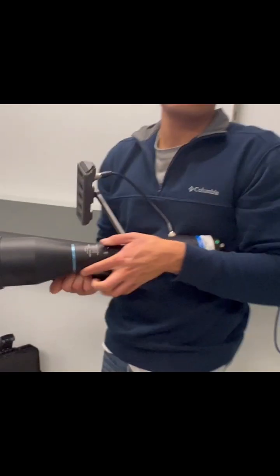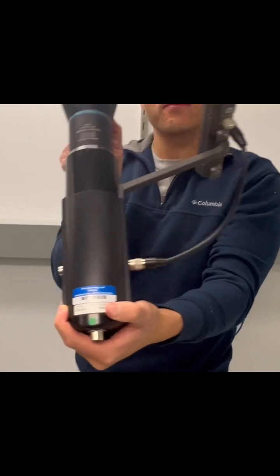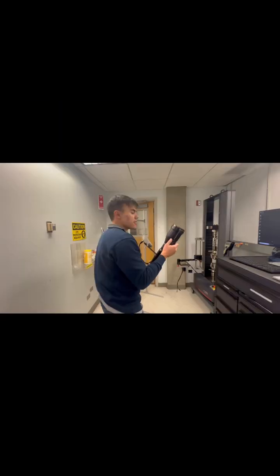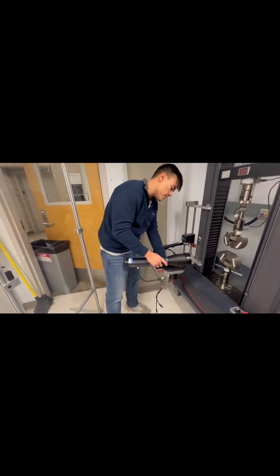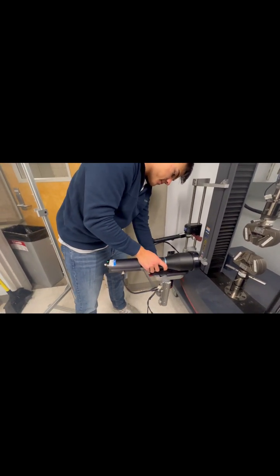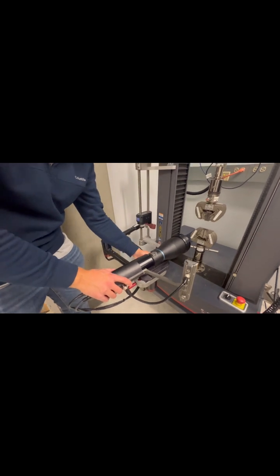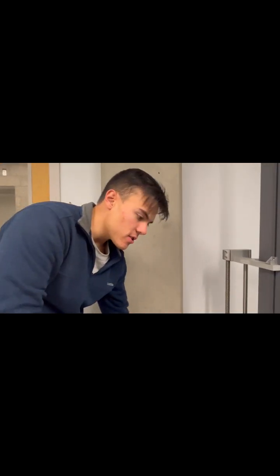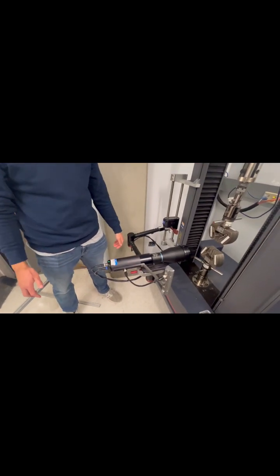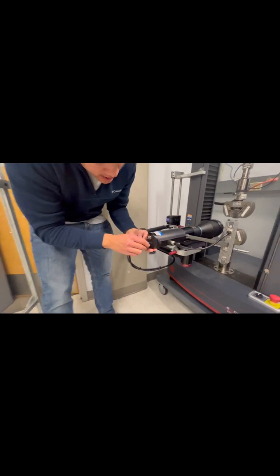All right, this is our video extensometer. It is $16,000, and as you can see, it's given to us by the ITLO. To power this device on, you first have to clip it into the mount. Once it is secure, we can lock it into place with this lever, preventing it from slipping out. And we can also lock the arm to keep it from swinging.